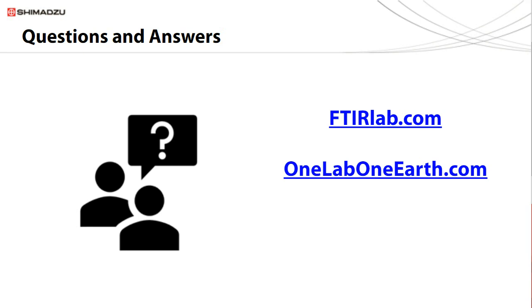Once you have your spectra, it literally takes a couple of clicks to add those to the libraries. Thanks, Sudhir. I think you brought up a very good point. The quality control that was put into the making of the library is something that we cannot forget. Yep, definitely.